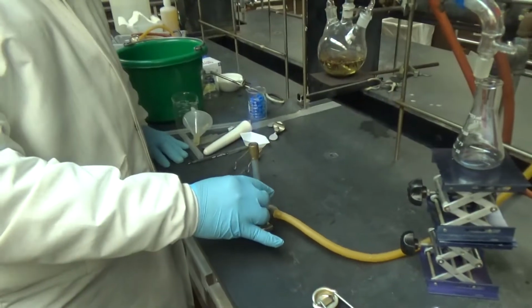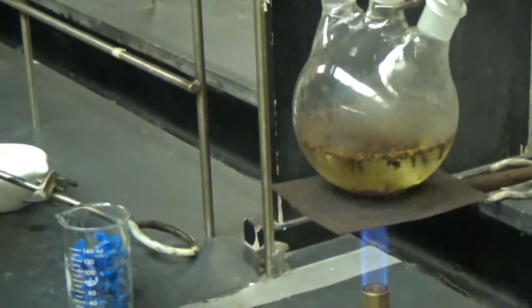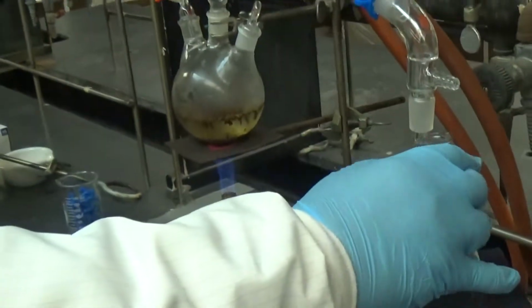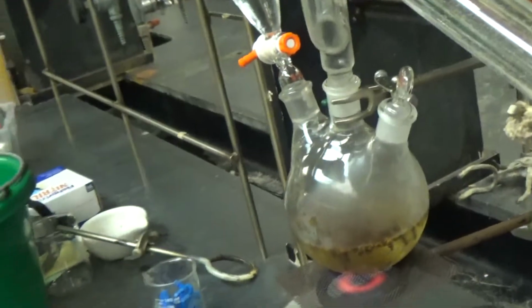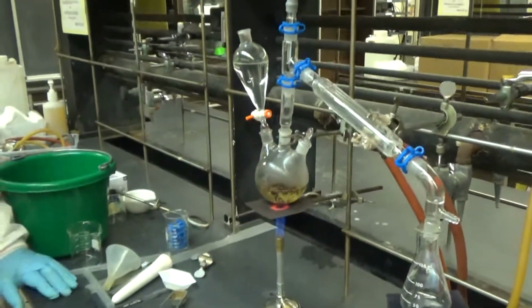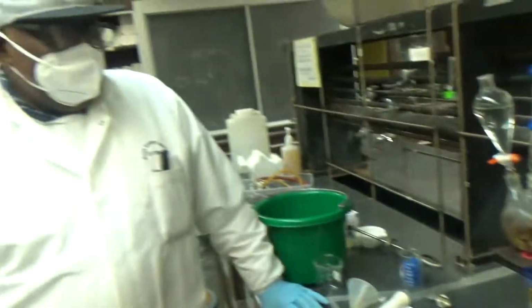So here is the Bunsen burner. I turn the gas on. The Bunsen burner is on. Put that here at the bottom, and we start with heating. We're going to collect the cold distillate here. Make sure everything is nice and secure. We got the clamps. Maybe tighten it a bit. Okay, cool. We're cooking at a high temperature with the Bunsen burner.